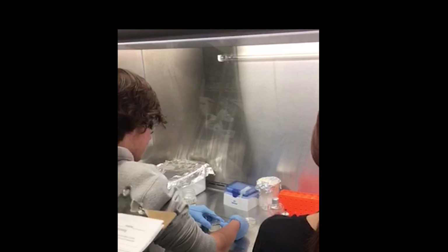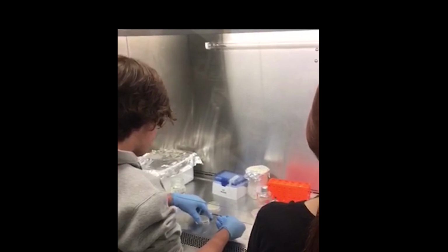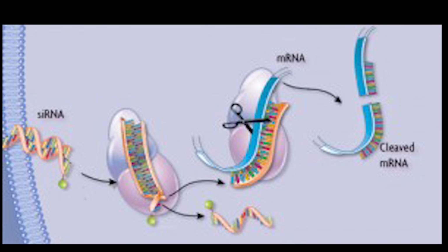When we provided bacteria containing this double-stranded RNA, the C. elegans would eat and digest it. The double-stranded RNA would enter the cells of the C. elegans. The RNA interference would be triggered, believing it to be a threat. The dicer, an RNA tool, so to speak, chops up all the double-stranded RNA into shorter siRNA. Those siRNA bind to several proteins, forming an RNA-induced silencing complex.